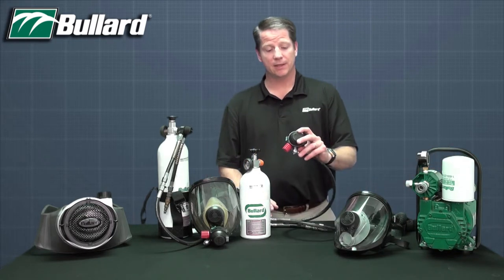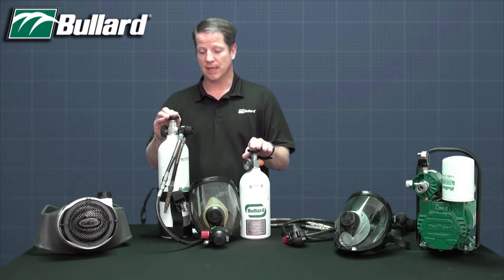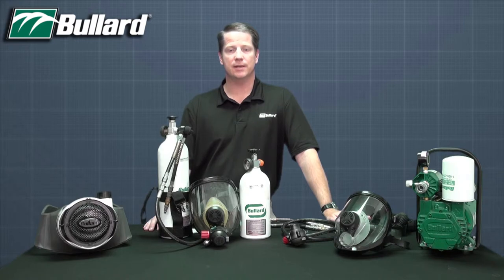Next, the Spectrum can be configured in pressure demand mode. Or finally, pressure demand mode with an egress bottle or an escape bottle — five or ten minutes. Demand simply means that as the positive pressure inside the mask were to be reduced to a certain threshold, it would demand more air to ensure proper protection levels.